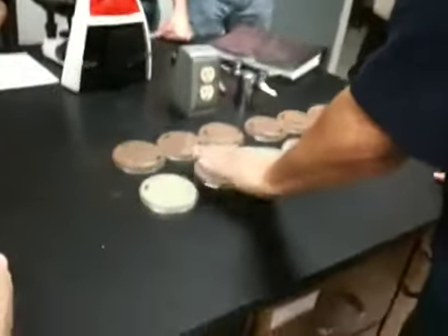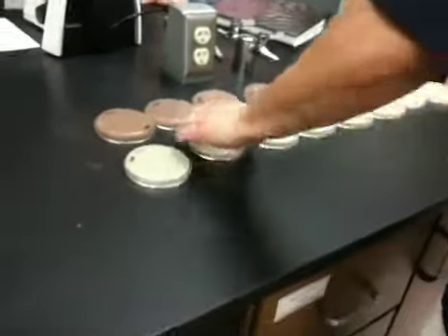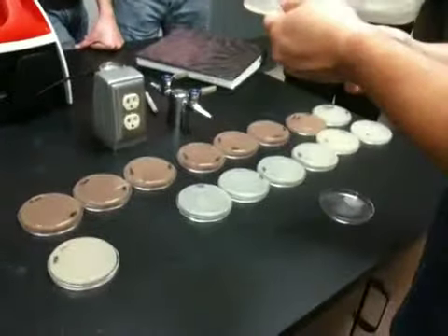And then here, even at 1 minute, the UV was effective, right? If you look at the 1 minute plate, you have growth, and just about everything was killed except the ones at the edges. Tell me again why the ones at the edge, shadow. So when UV hit it, there was a shadow produced.